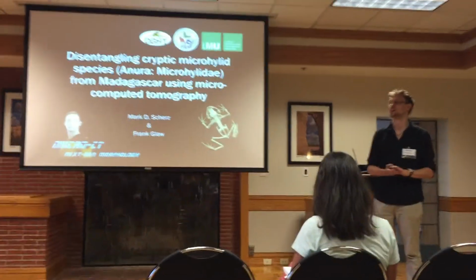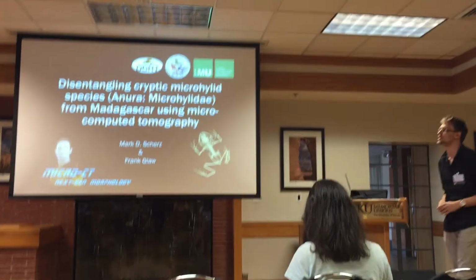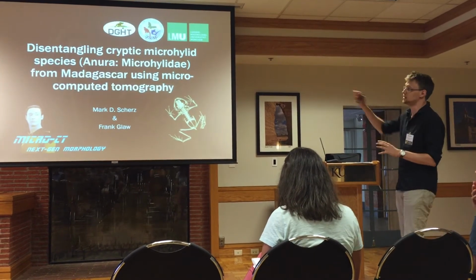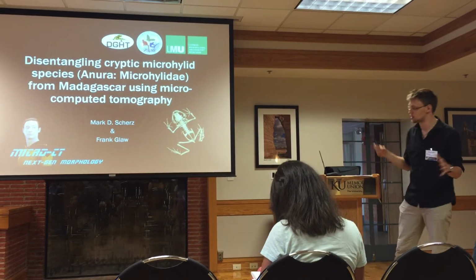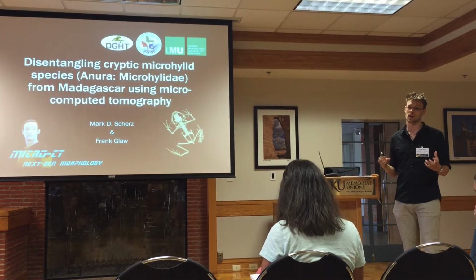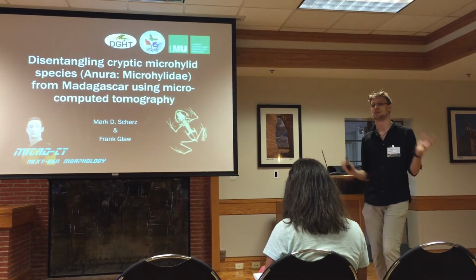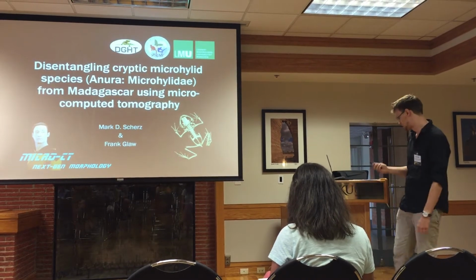Hi, my name is Mark. I am a researcher at the Zoological State Collection in Munich. And for the last 2 years, I've been working on disentangling cryptic species from Madagascar, specifically microhylids, using microcomputed tomography. I want to make a case for the idea that, well, we have next-gen sequencing already, but we need to move into next-gen morphology to complement that sequencing.